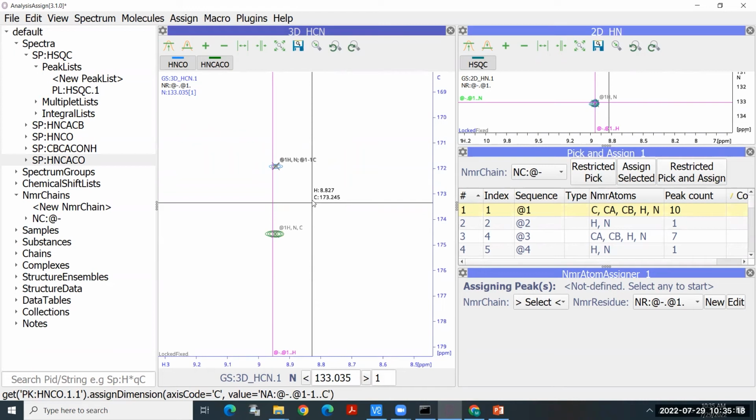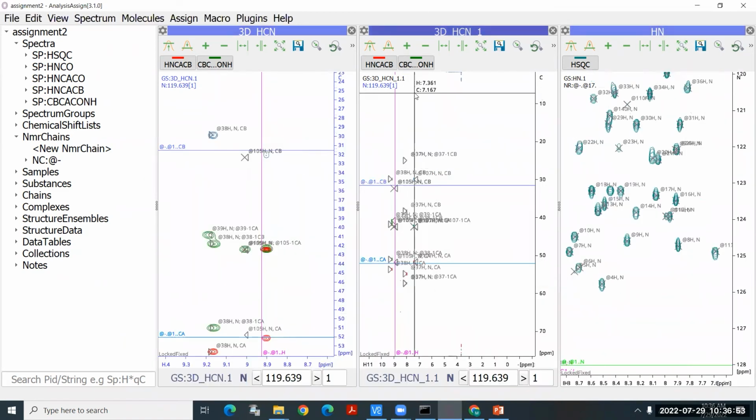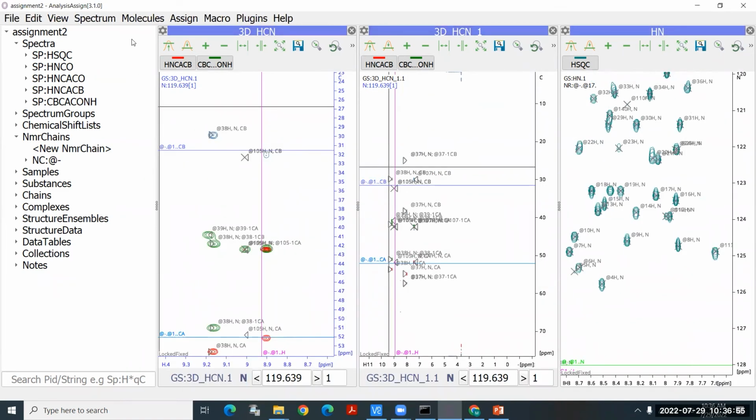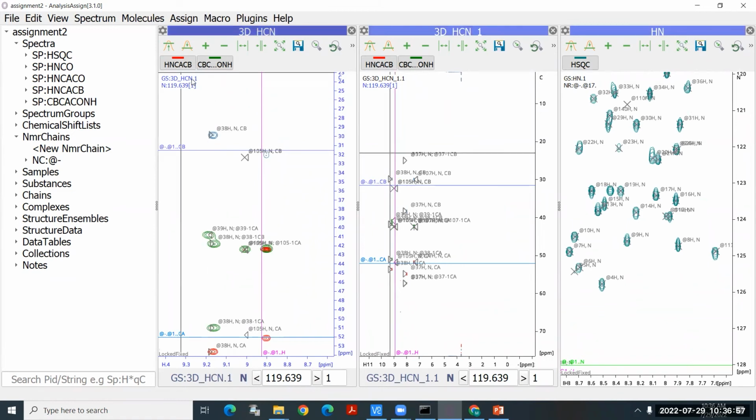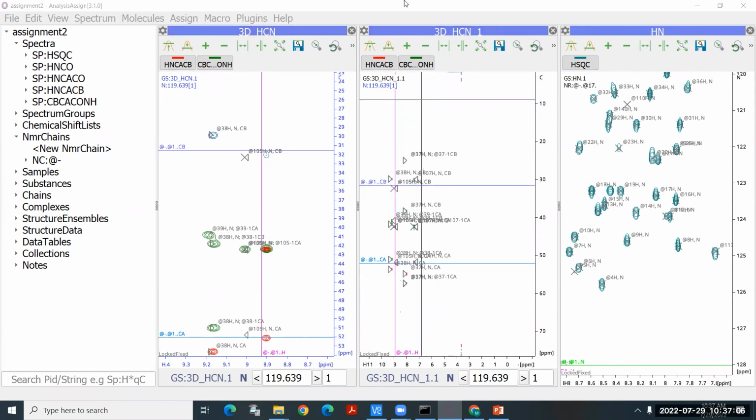I have a project, and we'll start from where I opened it. In this project, I already picked the peaks in HNCACB and CBCACONH. Also, let me make sure that we are recording.